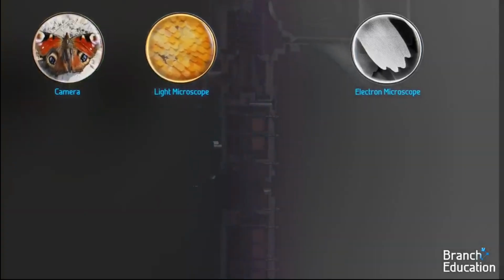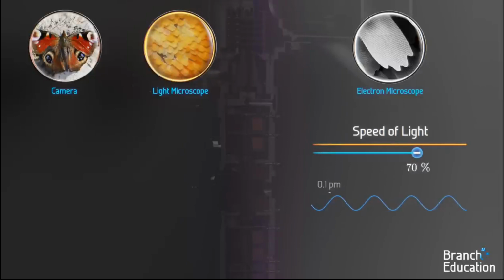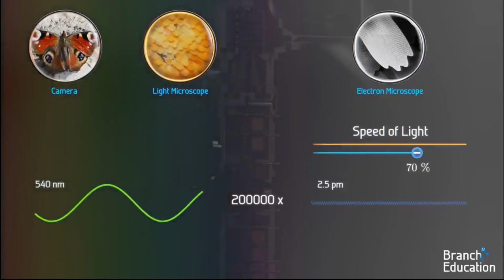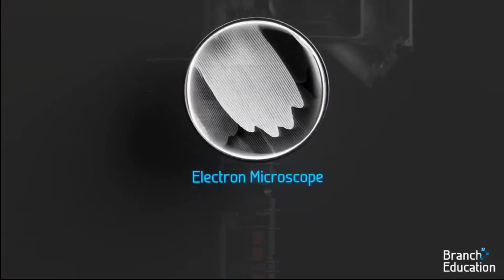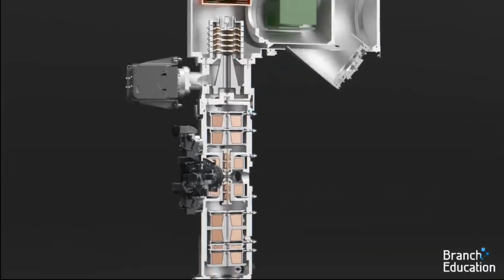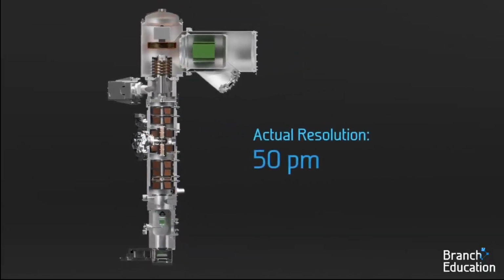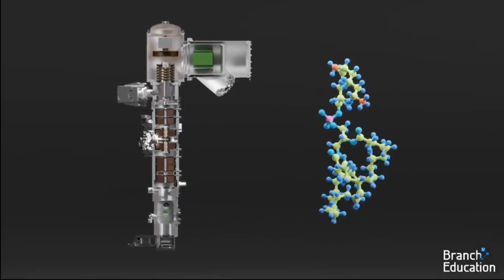However, in this electron microscope, electrons are accelerated to 70% of the speed of light and have a wavelength of 2.5 picometers, which is around 200,000 times smaller than visible light's wavelength. In principle, such an electron microscope could resolve features spaced just 1 picometer apart. But due to the magnetic lens's physical limitations, the real resolution is around 50 picometers, which is enough to see individual atoms in a material.